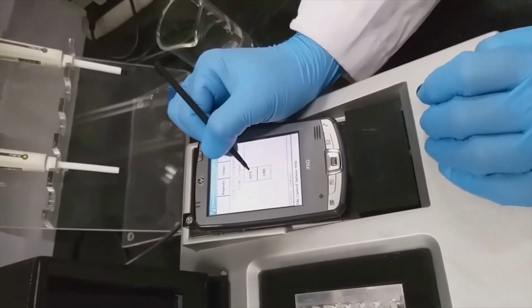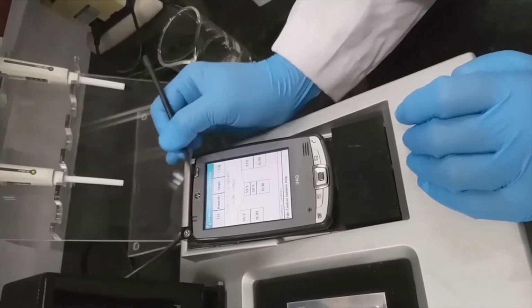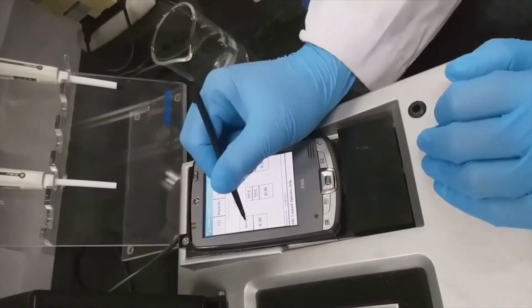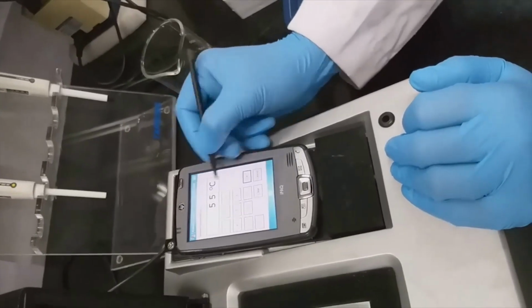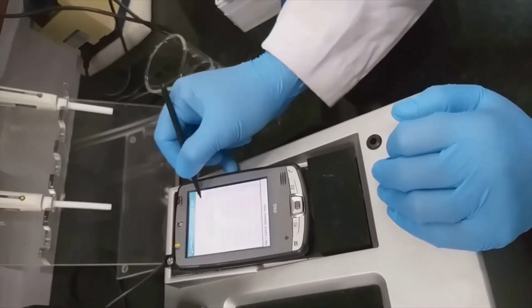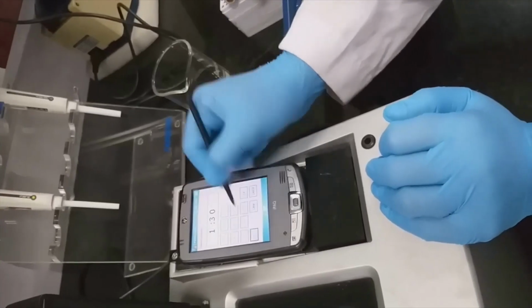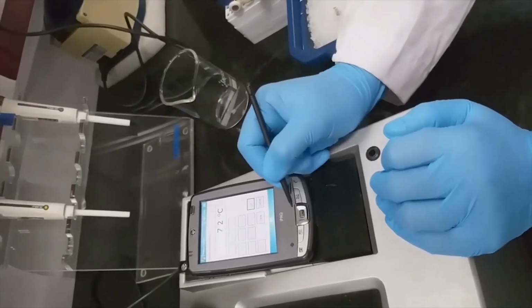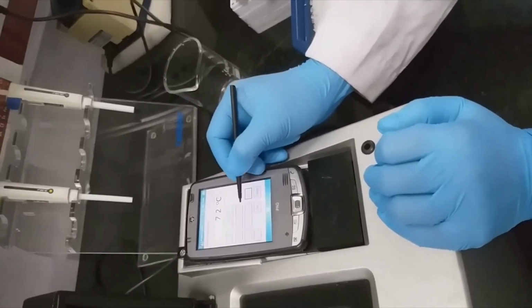For setting up a PCR reaction, initial denaturation is at 95 degrees Celsius for 3 minutes, and then we will use 30 repeats of denaturation for 30 seconds, annealing, and extension. Extension time should be given as 1 minute per kb.